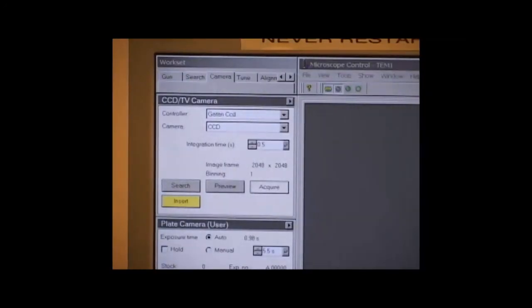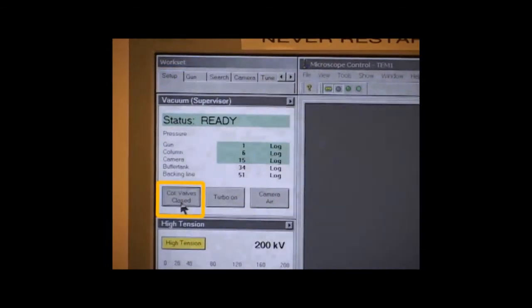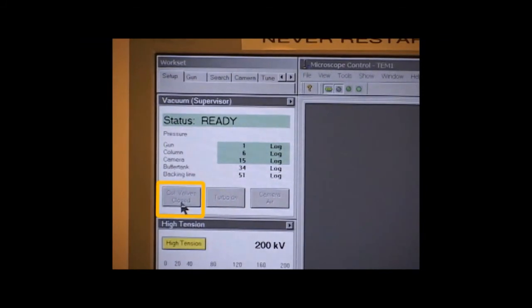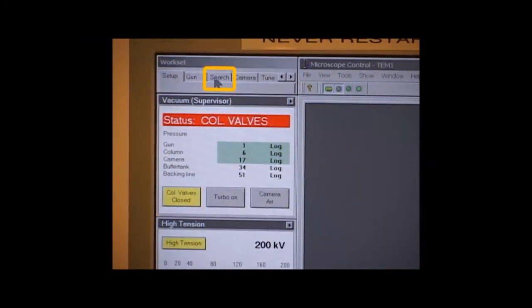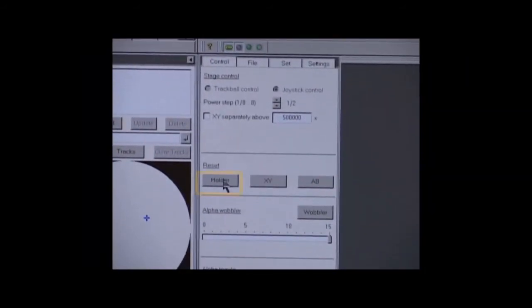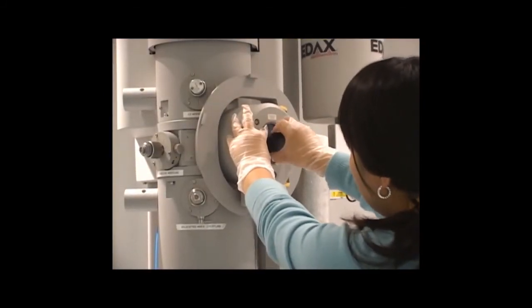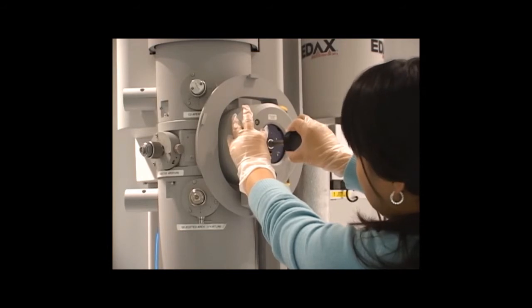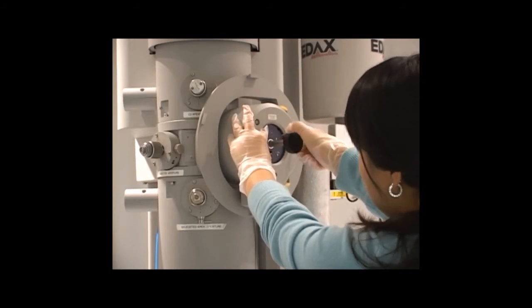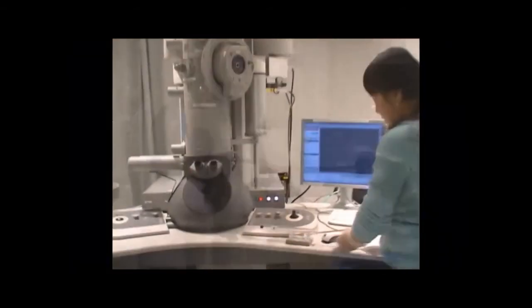When you are finished, go to the Microscope Control, Camera, and click Insert to take the camera out. Then go to Setup. Click Column Valves Closed to close the column valves and stop the beam. Then go to Search. Click the arrow flap. And in the Reset section, click Holder to put the holder in the original position and angle. When the light goes out, you can pull the holder out straight until you feel a stop, then rotate clockwise until you feel another stop. Then it will be easy to pull the holder out. Place the holder in the tube.